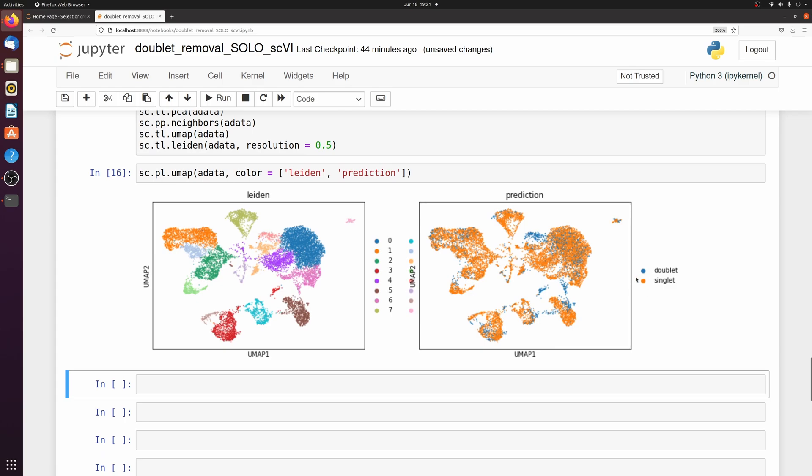So here in blue we see the doublets and you can see that some of these small clusters especially are almost predicted completely as doublets. And you see how cluster three is over here, and then there's a small cluster three that isn't close, and we see that this is all doublets.